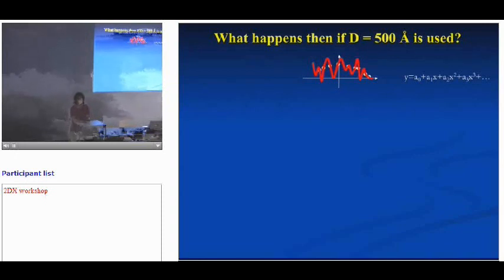At the beginning, before you knew how it was going to fit, you must have had some idea about the thickness. That's right. That's one thing that I should have mentioned. One of the ways of determining this number is using your biochemical information, how thick your crystal might be. You certainly don't want to go too far off.